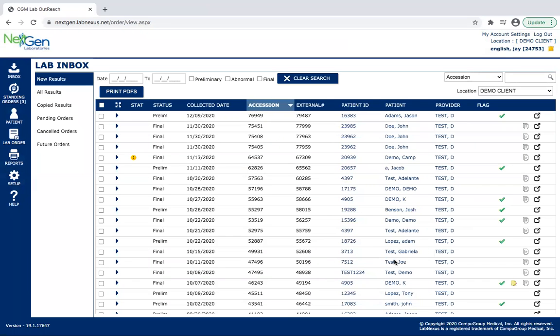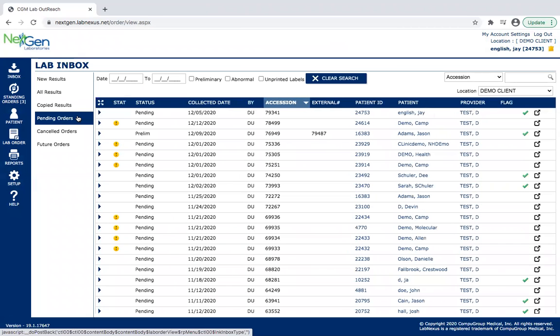At this point, the test has been created, but just to double check, here's how you do it. Under the inbox tab, scroll over. You're going to scroll down to pending orders, select pending orders. As you can see, J English is pending.